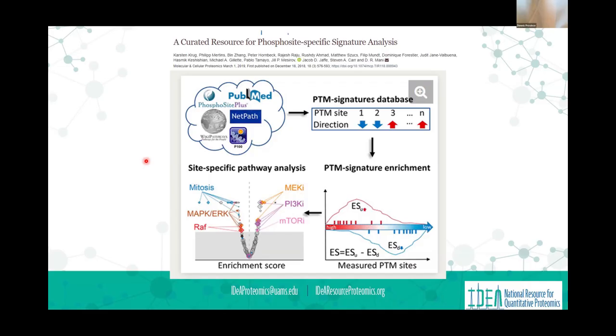For DIA, we have to do these enrichments individually. We don't get to mix the samples together. So there's more variability in the enrichment step, combined with a little more variability in the analysis. There are good published reports, but it's not quite ready for prime time. It's close, and people are doing it. But for us, it's probably going to take another 6 months to get comfortable with that workflow. The advantage is you're not going to be constrained to the limits of a TMT experiment.